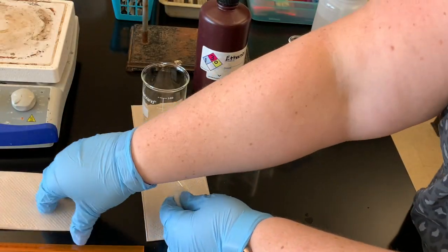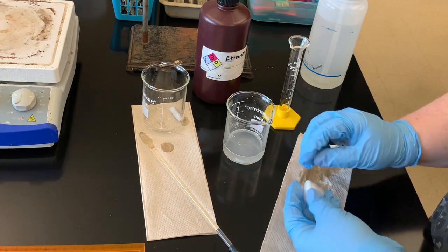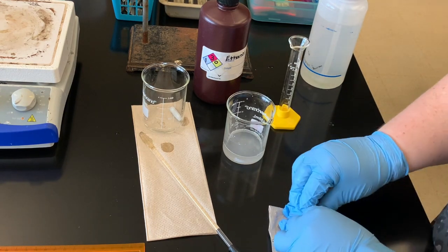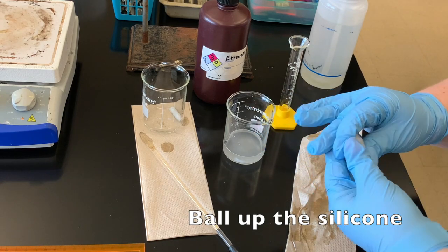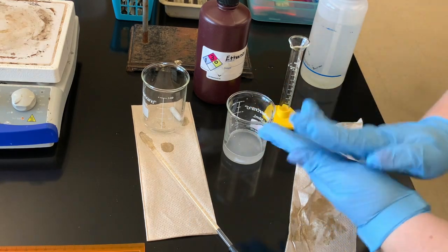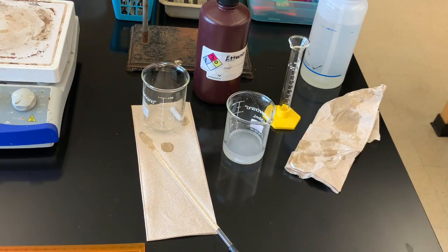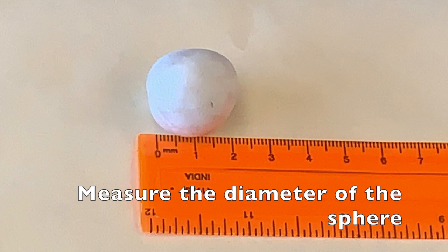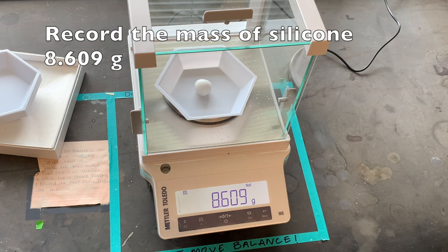I'm going to put this in some paper towel and squeeze it dry a little bit to get some of that moisture out. There's still a lot of moisture coming out, so I'll put it in my paper towels again. I'm going to try to make it into a sphere. I have that sphere — we'll take the diameter of that. The mass of our polymer, the silicone silicate chain, is 8.609 grams.